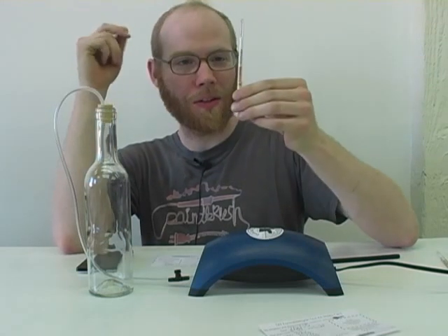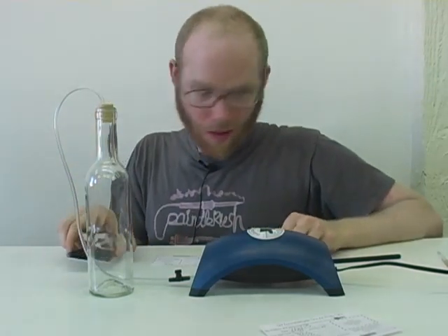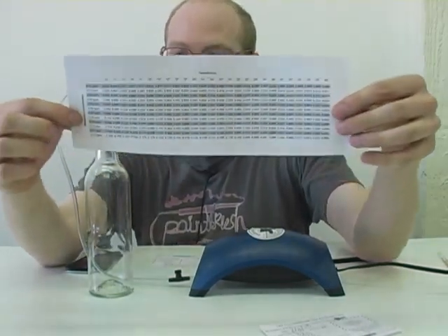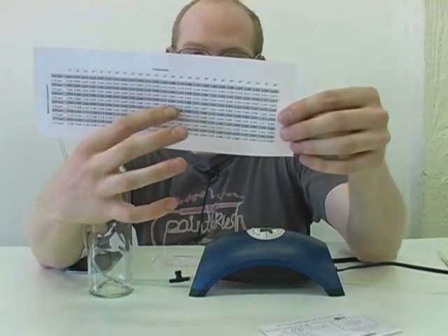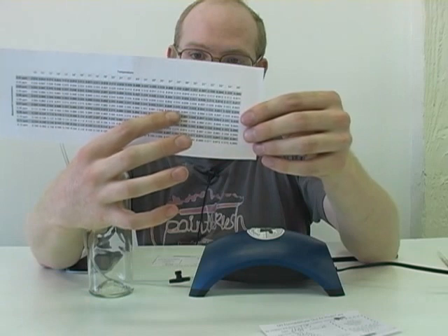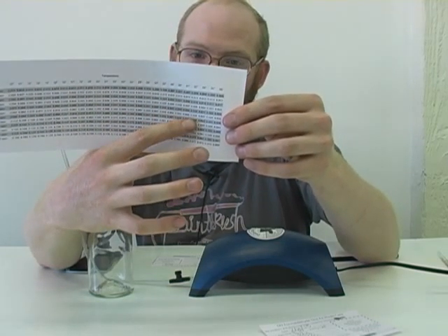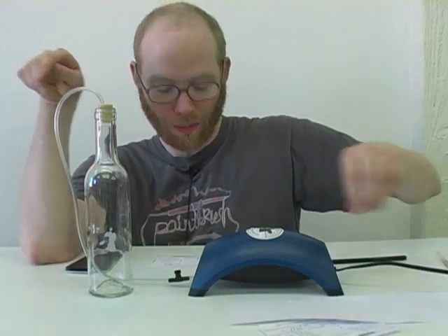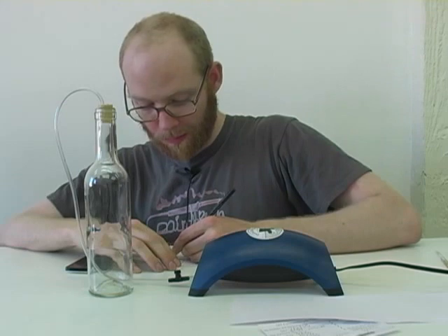It looks like it's staining down to about 0.7, which I can then look up in our chart. So I got 0.7 — I can follow this row across. The temperature in here was 32 degrees centigrade, so we're looking at 42 parts per billion, or 0.042 parts per million, as our final reading. Actually, correction: 0.045.